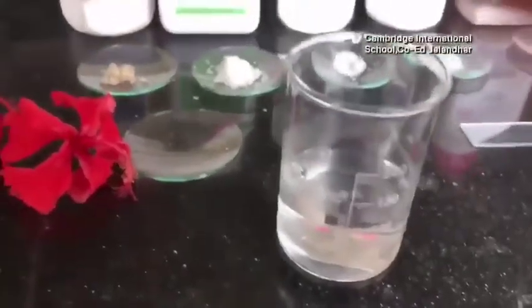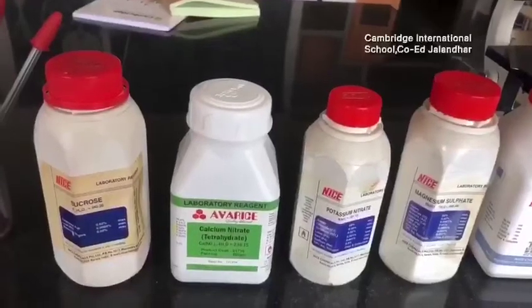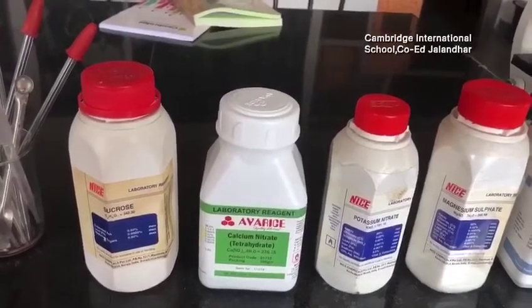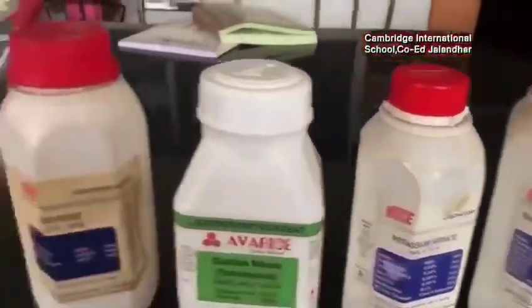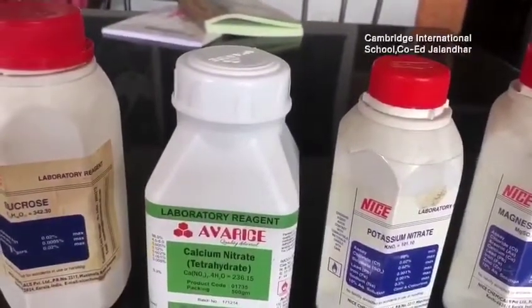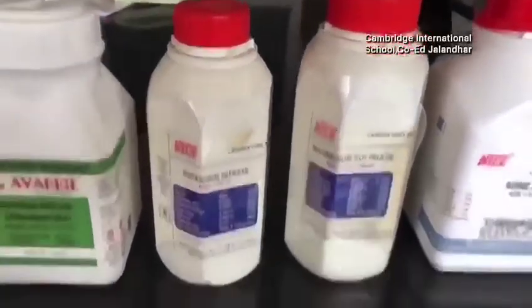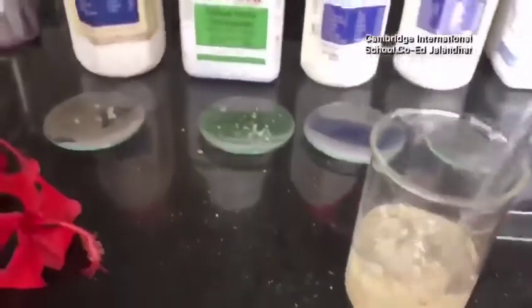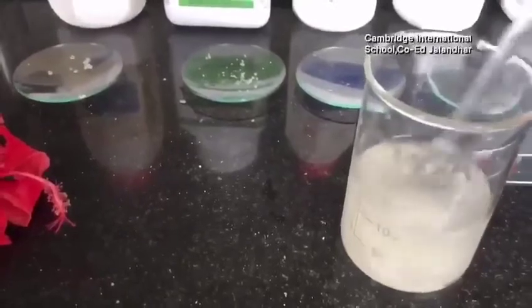In the beaker, we have taken 100 ml of distilled water. First of all, we have prepared a solution containing sucrose that is 10 grams, boric acid that is 10 mg, calcium nitrate 30 mg, potassium nitrate 10 mg, and magnesium nitrate 20 mg. We have added all of these together in 100 ml of distilled water and prepared a solution.